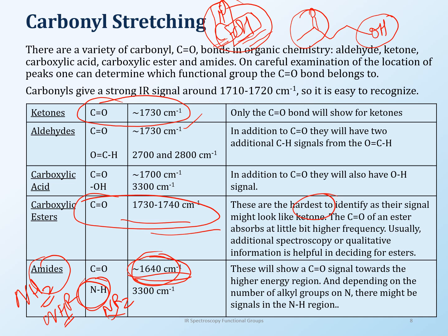But this is just an introduction. Let's look at some of the spectra and see if we are able to understand. Now, these are just examples. You'll have more in assignments.